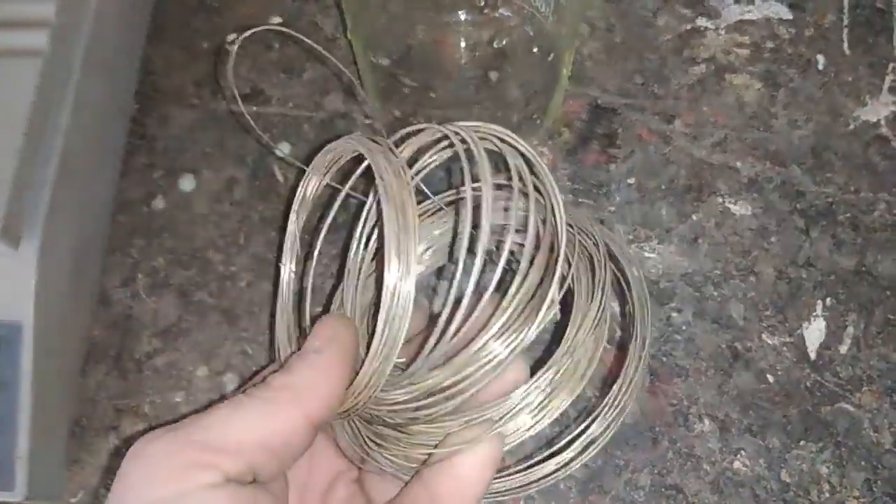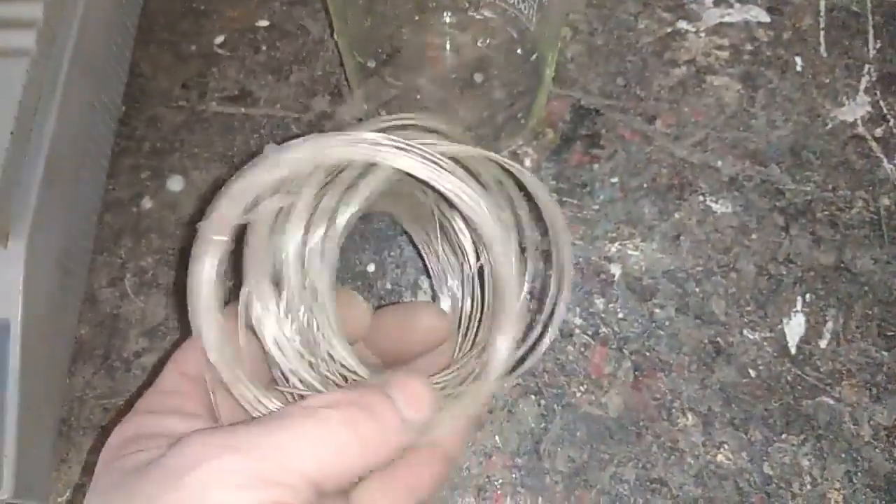Hey guys, Frindus here. In this video today we will repeat the process from the last video, but with a different item. You see that in my hand is a silver plated copper wire.